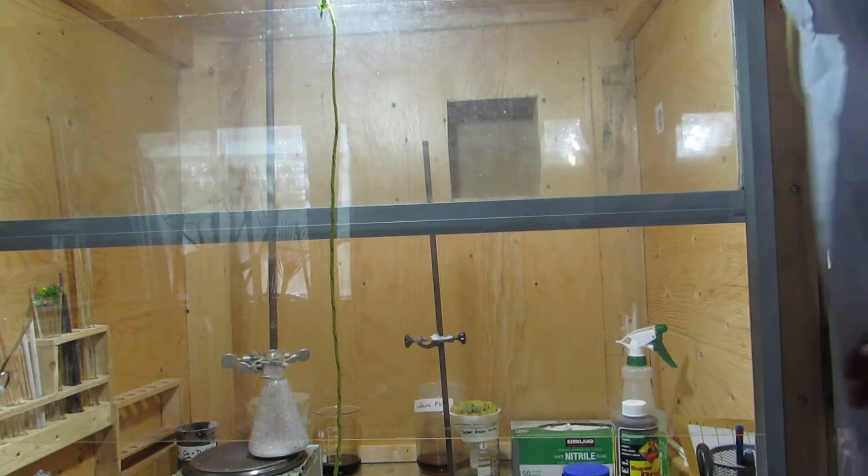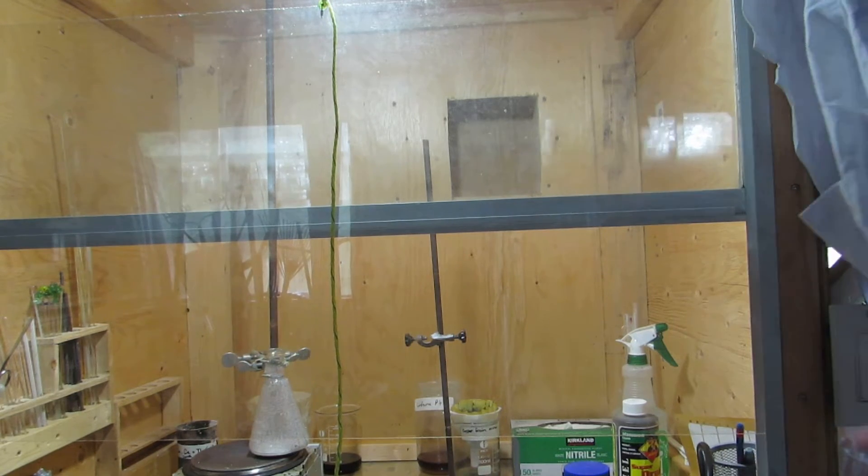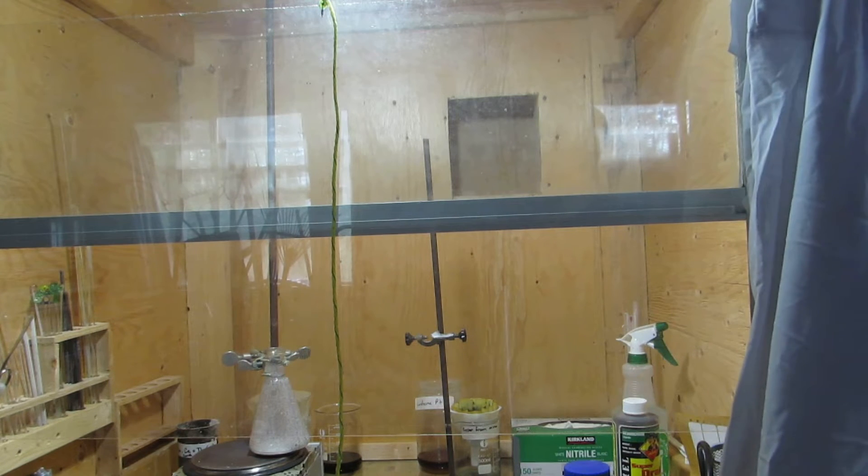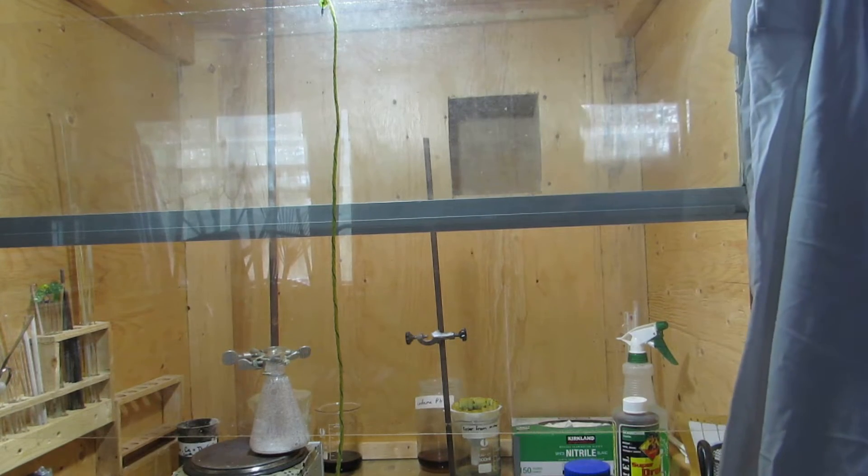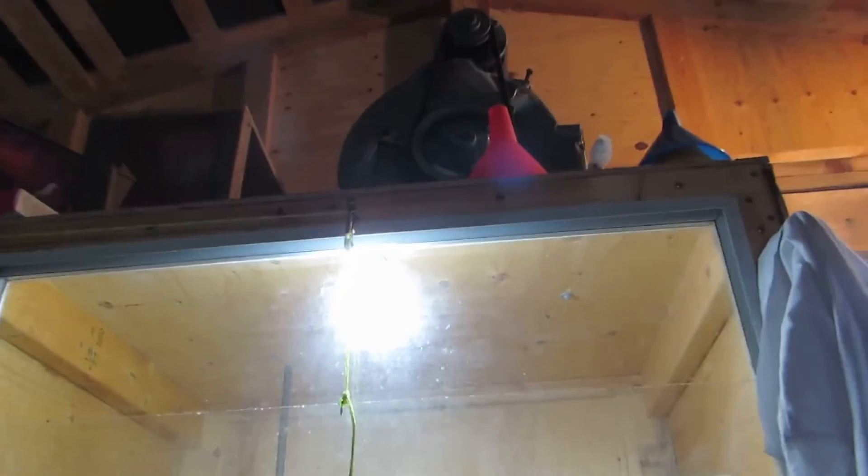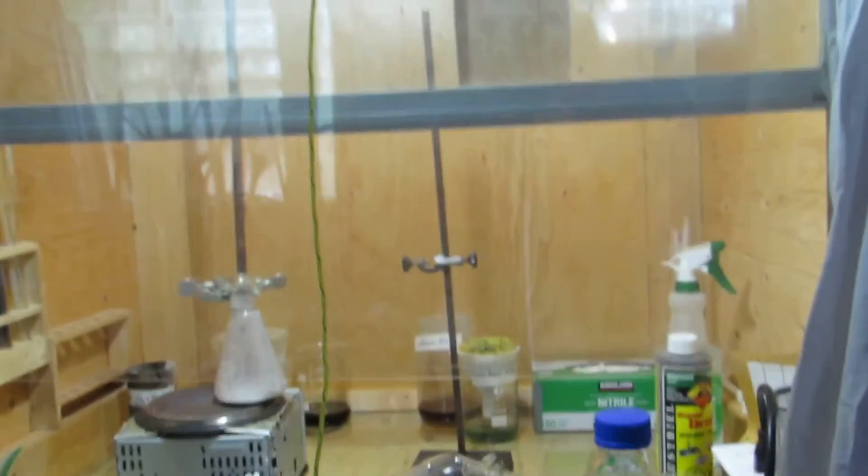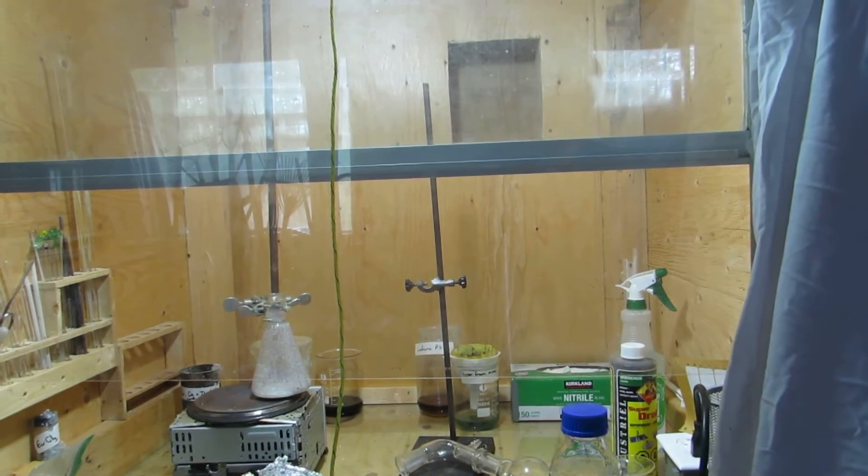If I flick the switch over here on the side you can see we have a significantly more powerful fan. So it requires a significant amount of amperage to start up but once it's running the airflow through here is pretty impressive. A lot better than what I had before with the bathroom fan. You can see up there that's the fan itself there. Just an old air conditioning unit fan but it pulls an insane amount of air through.